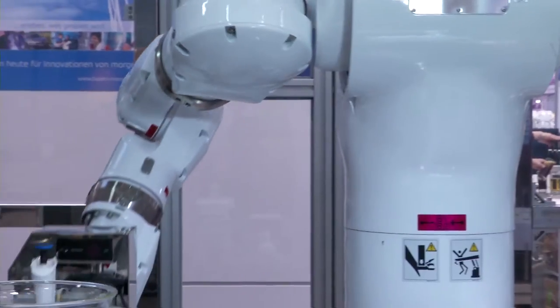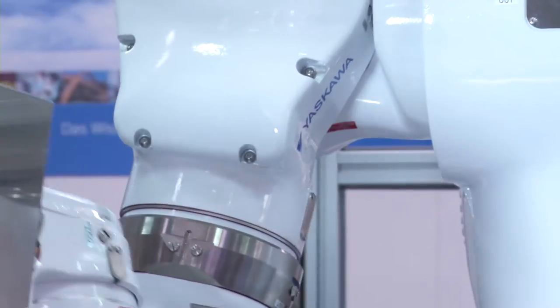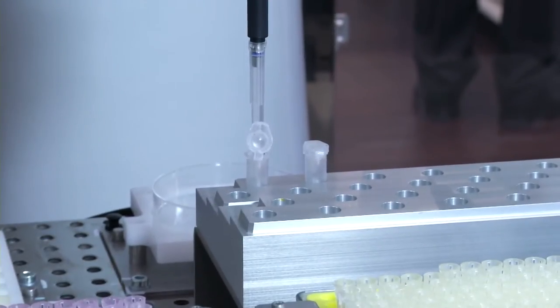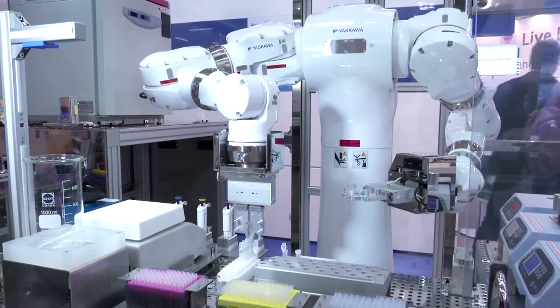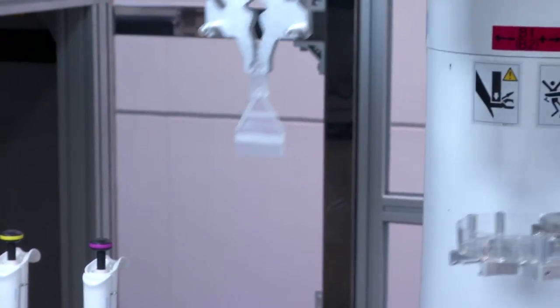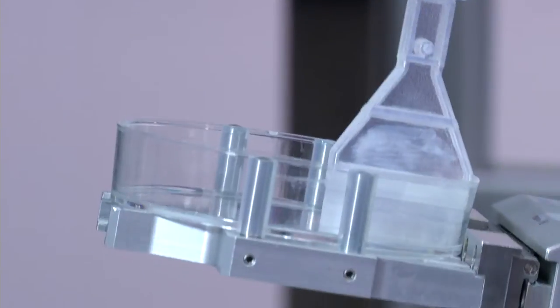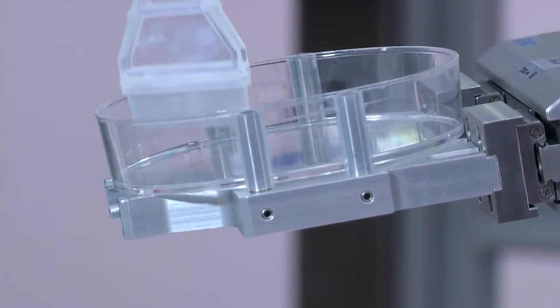Now let's see how robots will in future be involved in examinations done in genetic labs. Robots will in future be deployed where extreme precision is required and where there is a need to repeat procedures almost without limit. With the robots, the customers can have automation, but with the flexibility of a manual workstation. They can set up procedures using the robot prior to commencing production of a pharmacological product and before investing millions in a production line.